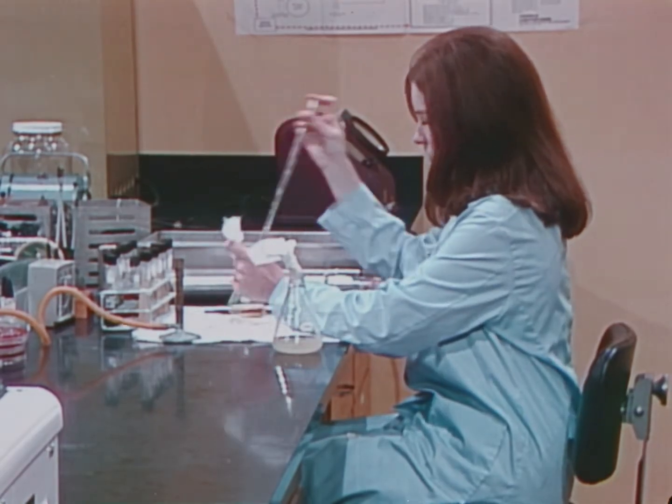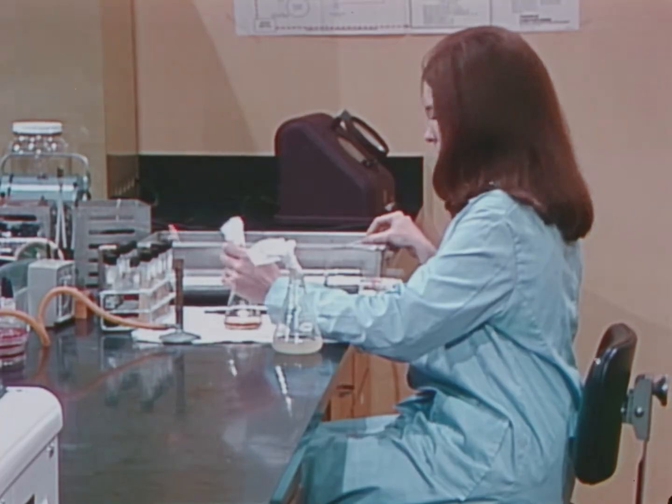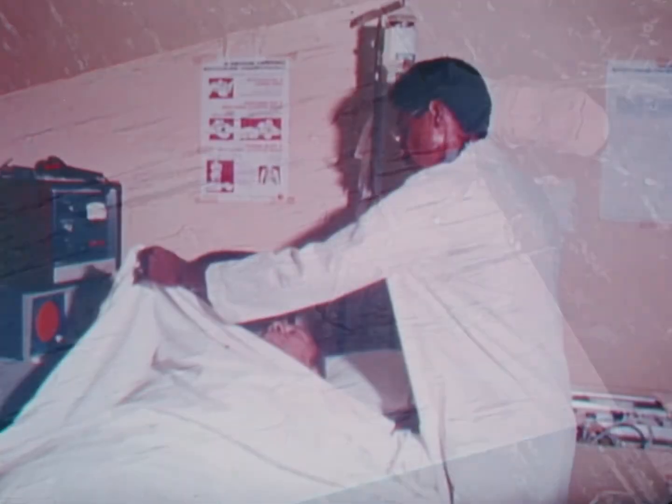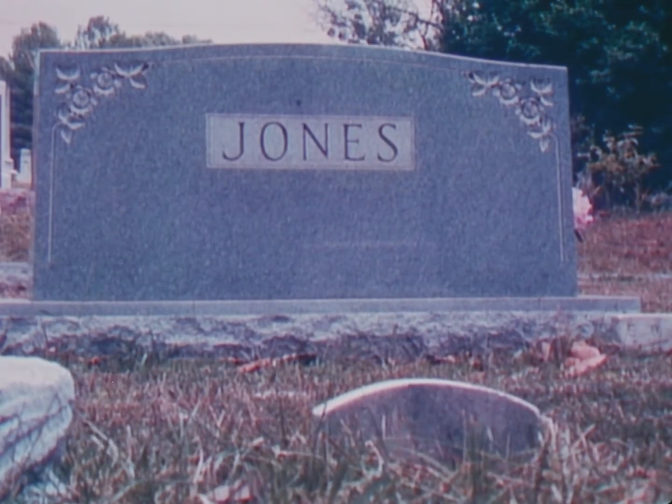Laboratory-associated infections continue to be serious hazards for people engaged in research or clinical diagnostic work. The magnitude of the problem is apparent from data accumulated during the last 50 years. Since 1925, some 4,000 reported infections have endangered the health of laboratory workers. 160 of these infections resulted in death for the individuals involved.